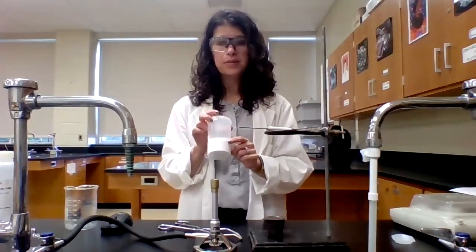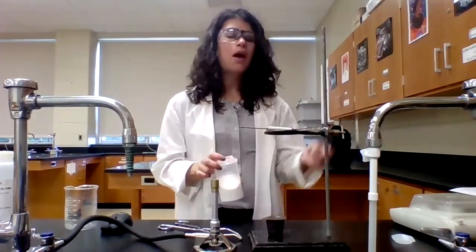Now notice I did put the lid on. So why am I doing that? Now that I've heated it and driven off the water, I don't want any water that's in the atmosphere to condense back on. So I'm putting the lid on while it cools so that no water can get into the crucible. I'm going to let this cool, and then I'm going to weigh it. And once I've done that and recorded that mass, I'm going to add my 2 grams of my unknown carbonate, and I'm going to heat that again as well.